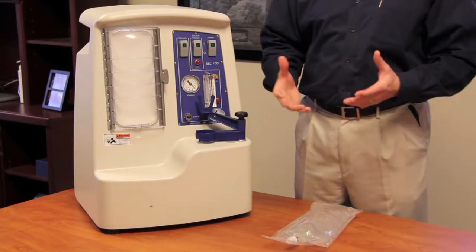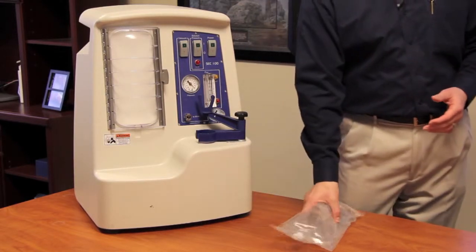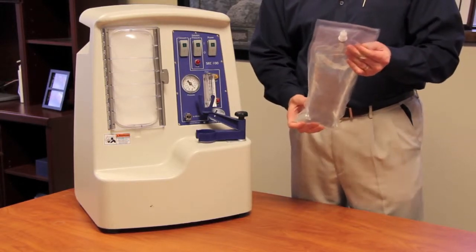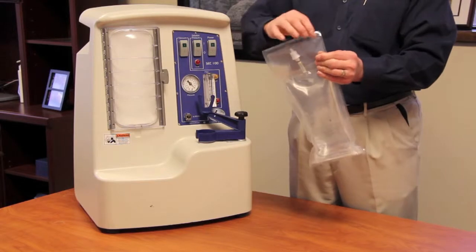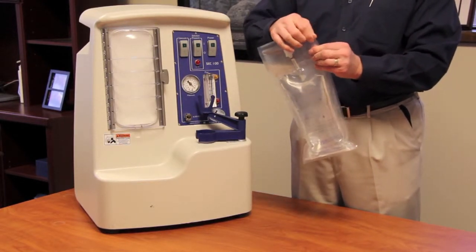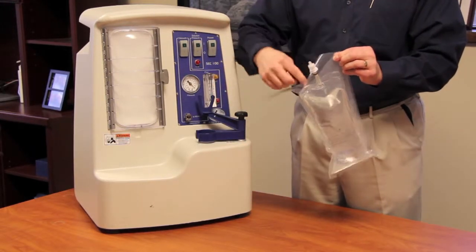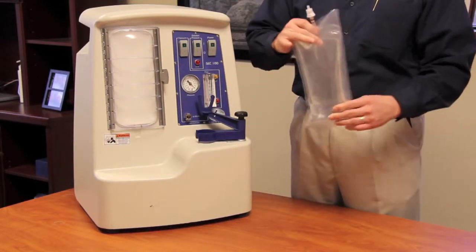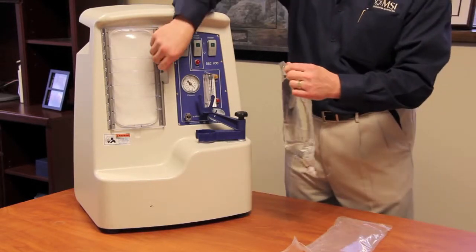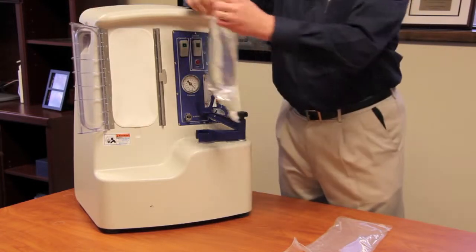In assembling the MVAC System to take a sample, the first thing you want to do is grab the solution bag. It's in its overwrapping, and both the solution and the tubing have the same style of overwrapping. If you'll notice at the top, it has a little notch in it, which makes it easy to open — you simply tear it. From there, you pull the solution bag out of the overwrapping and hang it onto the door of the Support Equipment Case. You open the door and there's a little notch on top of the door where you hang the bag.